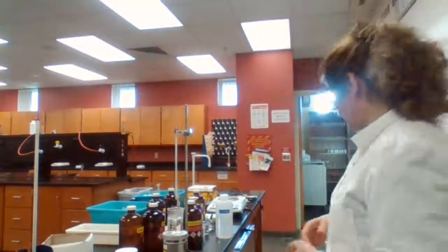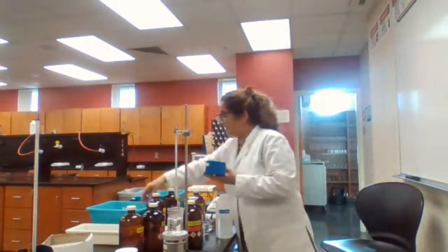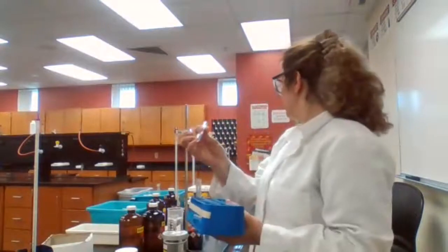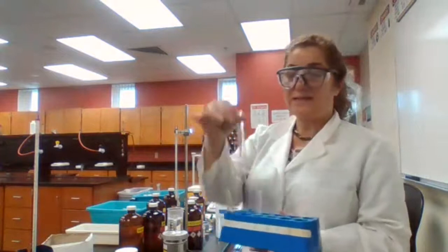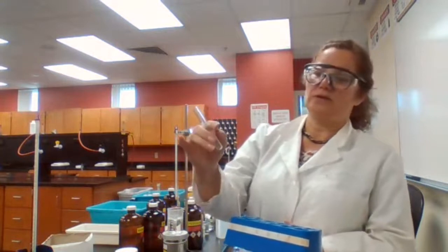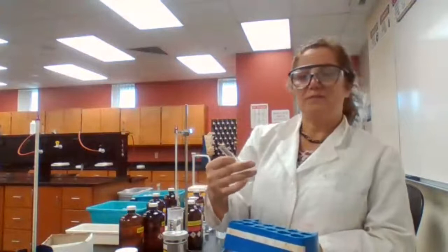Part C of the experiment is solubility, the solubility of a solid in liquid. How do we know a compound is soluble? To test if the compound is soluble or not, we are going for solid in liquid. It's very easy and obvious to recognize. We take a tip of a spatula of the sample and place it in a test tube. We add solvent and shake it. If the solid disappears completely, it's soluble and your solution is clear. If the solid does not disappear completely and your solution gets cloudy, that can be classified as partially soluble, somewhat soluble.